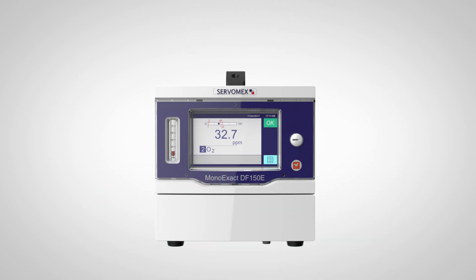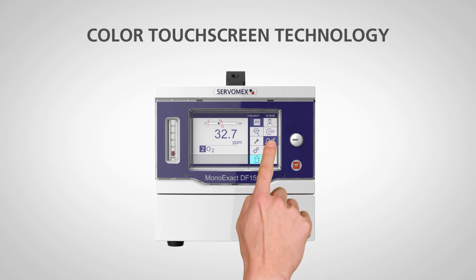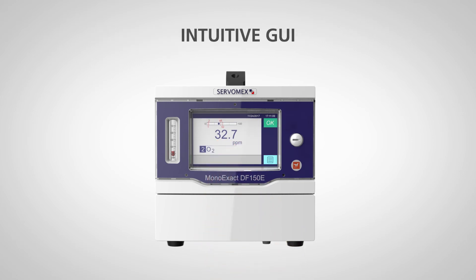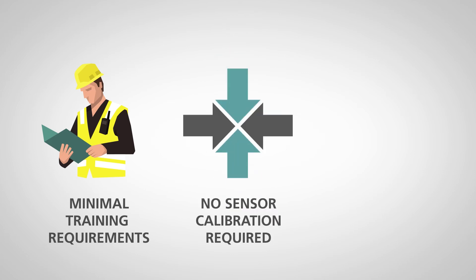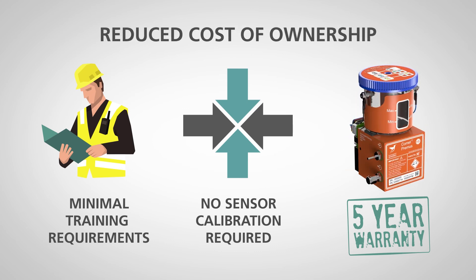This enables customers to benefit from many new features, including a high-brightness color touchscreen display with a simple icon-driven, guided, intuitive user interface, which means there are minimal training needs, no sensor calibration requirements, and a five-year warranty on the sensor, resulting in a reduced cost of ownership.